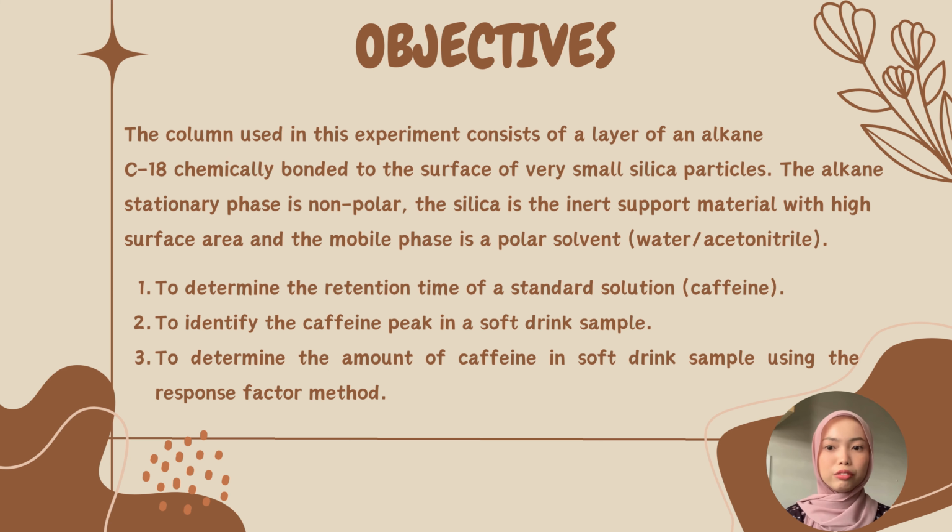Our first objective is to determine the retention time of a standard solution, which is caffeine, that we use in this experiment. The second one is to identify the caffeine peak in a soft drink sample, and the last one is to determine the amount of caffeine in the soft drink sample using the response factor method.